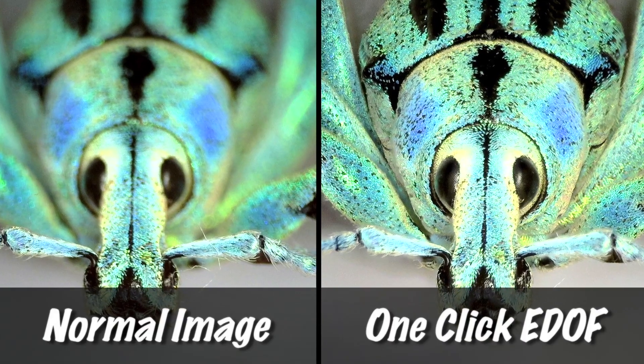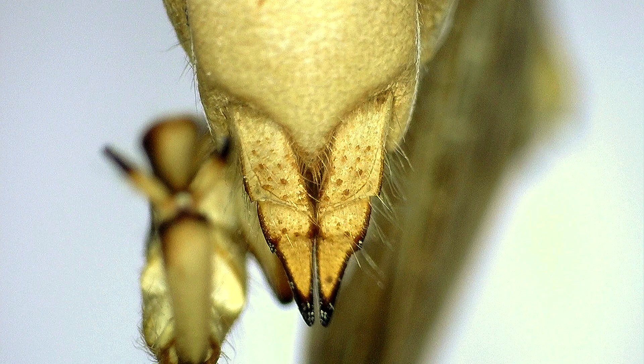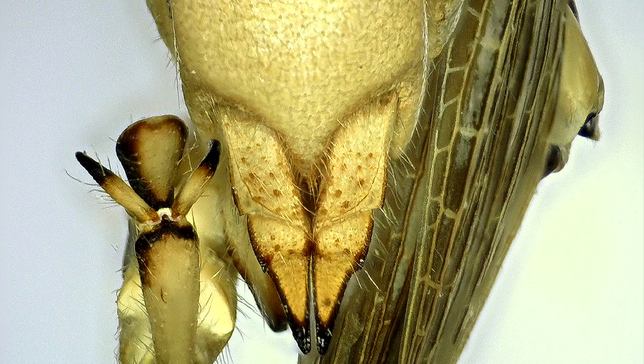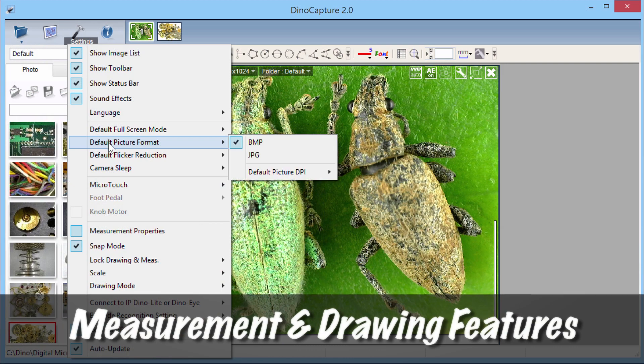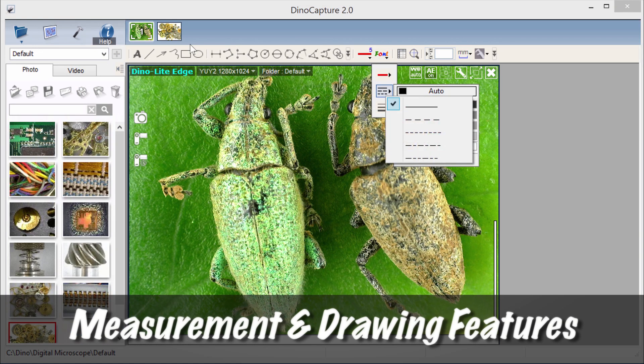For more advanced users, manual mode is also available. EDOF captures multiple images at different depths and stacks them into one clear image. The included software also has measurement for compatible models, as well as drawing and annotation tools.